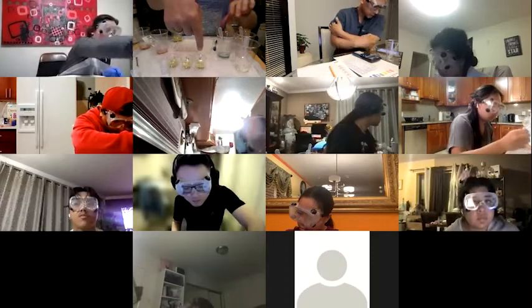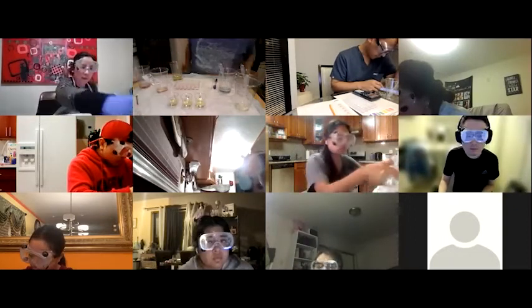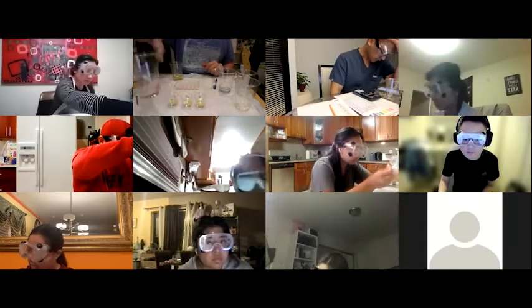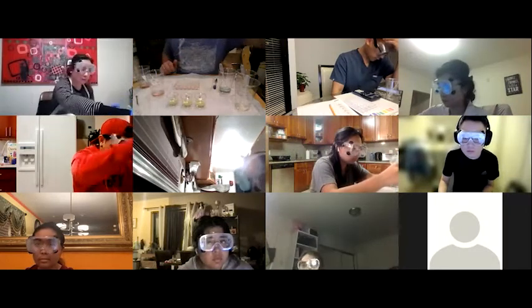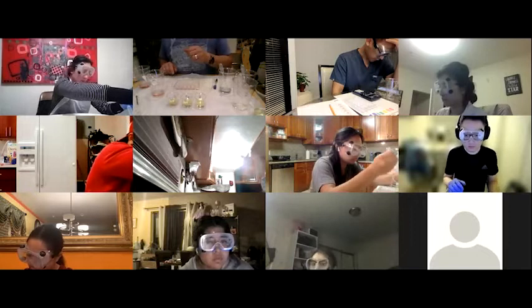Okay. So I've got 15 mils of water in each of my 3 dilutions here. So I'm going to put 5 of my pH 4.7 in the first one. And that'll be my first 1 to 4 dilution.